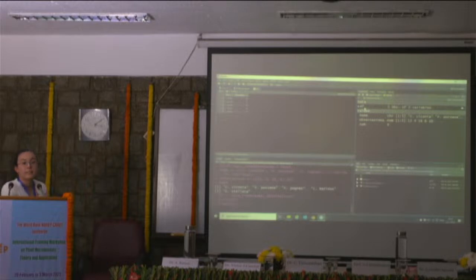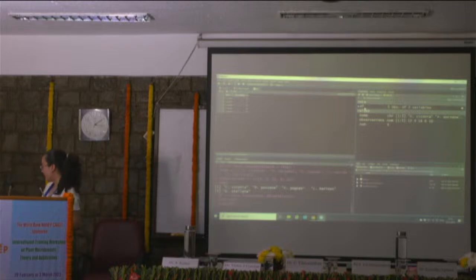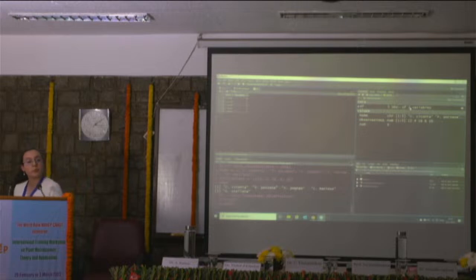Do we all have the table? Okay, great. Another thing that you can see in the environment part is this very small description of our table. It says 5 observations of 2 variables, and that is a summary of the dimensions you have. So 5 observations because we have 5 rows, of 2 variables, which are the 2 vectors that we had that are now columns in our table.